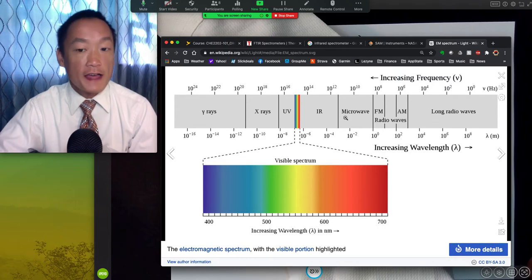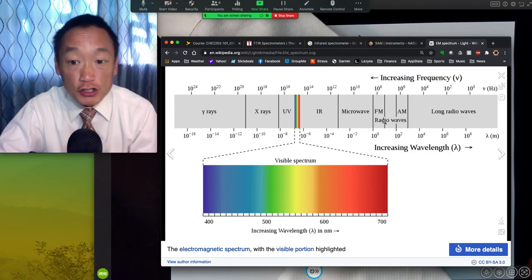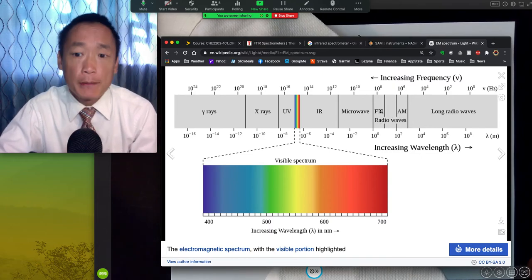And so if that's occurring with OH water molecule bonds, here's the wavelengths of light that covers the motion of those bonds in organic molecules. We'll also be using these radio waves and NMR down the road.